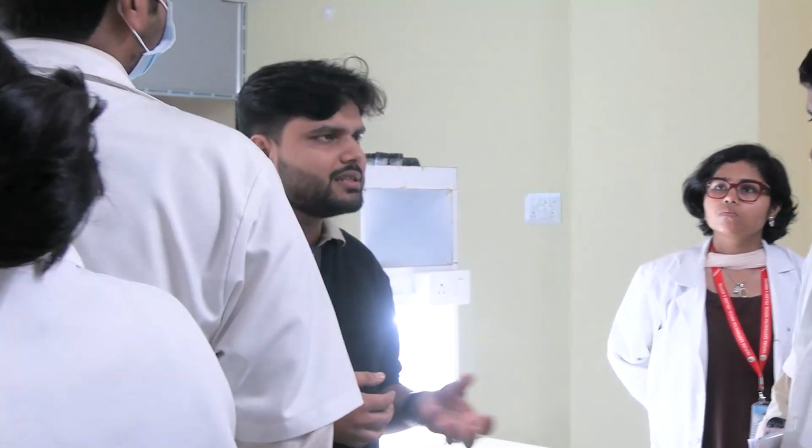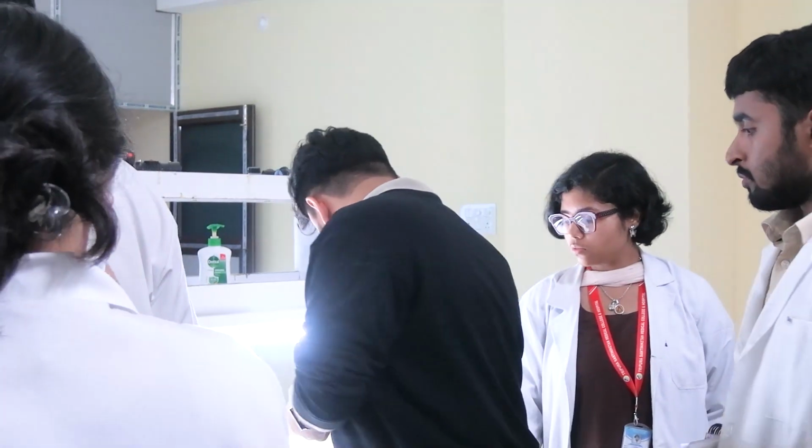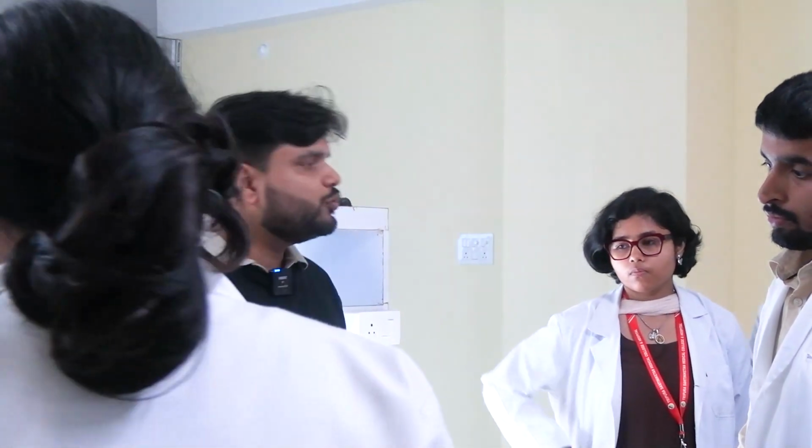Okay, first one is the macroscopic. After that, we have got the microscopic ones. Okay, microscopic is the stool examination that you will be doing. But what happens is that the trophozoites, the eggs, they are usually present in a very small amount. So we need to concentrate the eggs and the trophozoites so we can find them very easily.